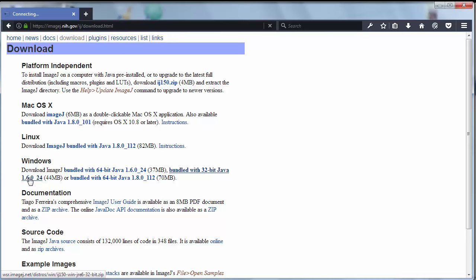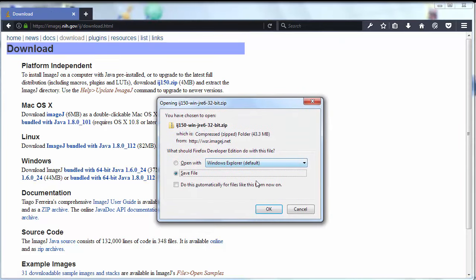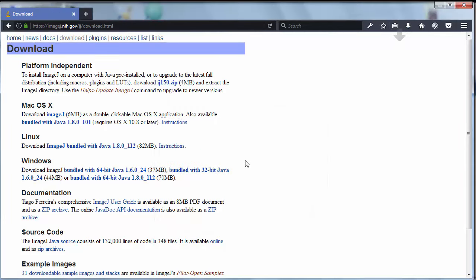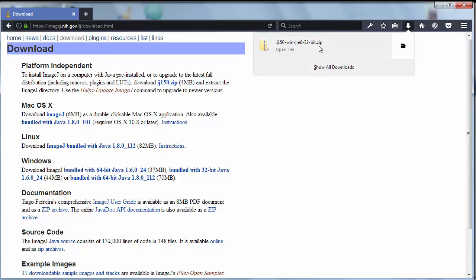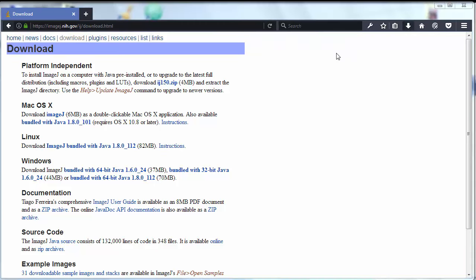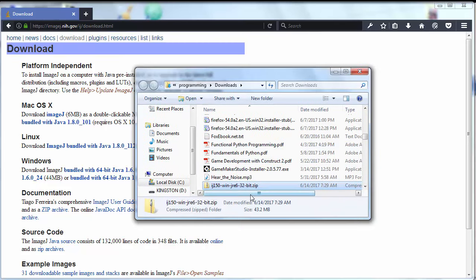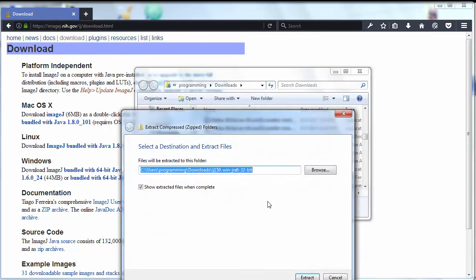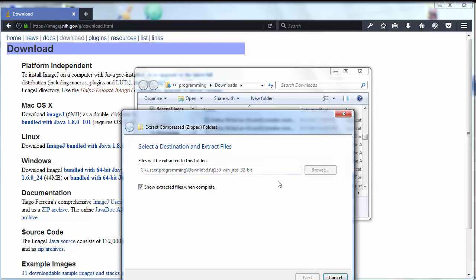First I'm gonna click here and then I'm gonna save it to my computer. Now this file has been downloaded to our computer and I'm going to extract it to my computer.